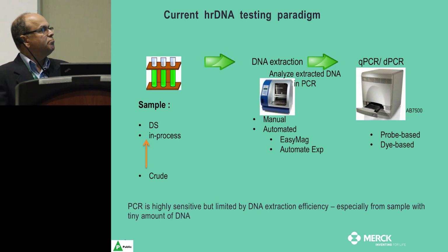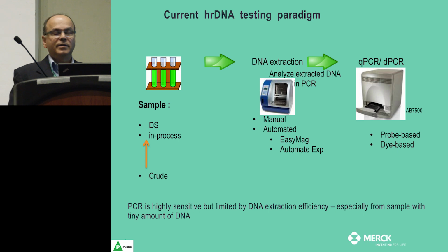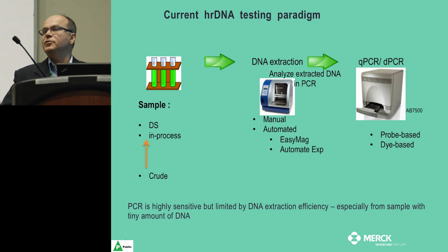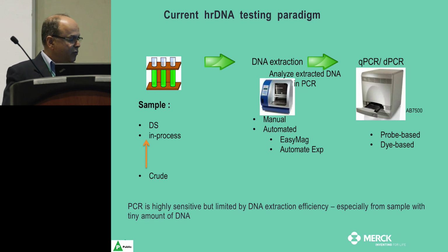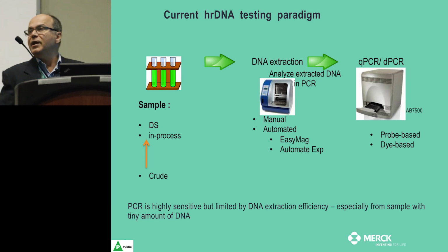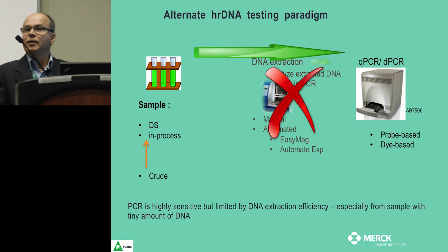Now, there are many methods of extraction. The PCR can be probe-based or dye-based, but no matter how sensitive or efficient this step is, the DNA extraction step kind of limits that efficiency. We are kind of dependent on the extraction efficiency. So the paradigm we wanted was this. We want to eliminate the extraction step and be able to test the sample directly.